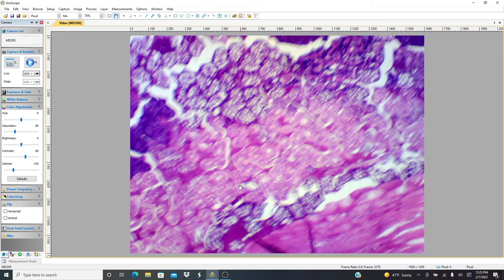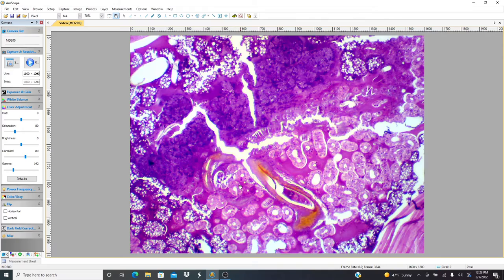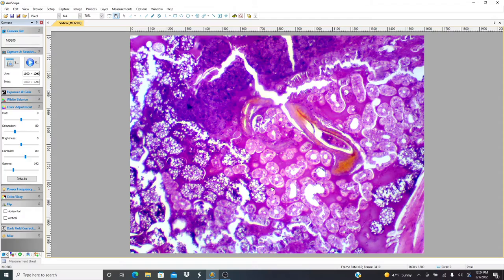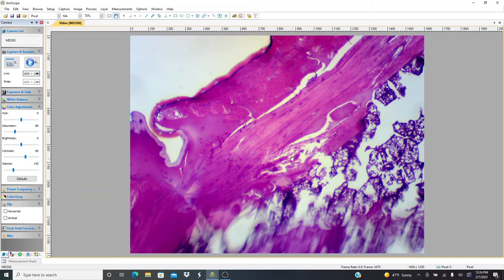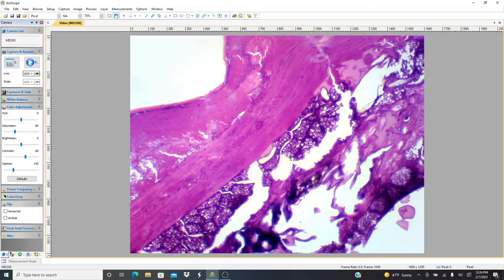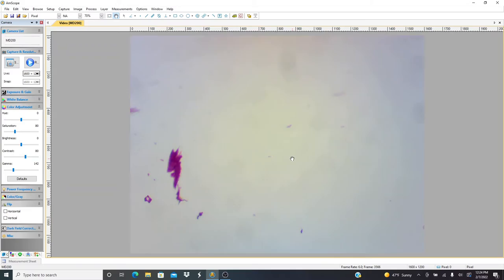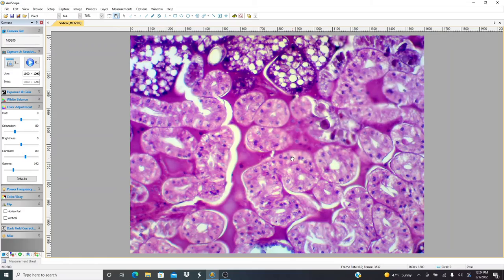Heading this way and going away from the head, I think at some point on this one we run into ingested material within the gut. Maybe that. I'm not sure. But we've got just a bunch of glands forming some kind of structure in here. I don't think it's a gut because those usually have a more different histology than what we're seeing here. But I think overall we got a decent cut of part of this centipede, but not a perfect section. It starts to kind of break apart here, and it's all broken over here. So I think the best details we got are around here, and then moving forward, have to go slower on high power.